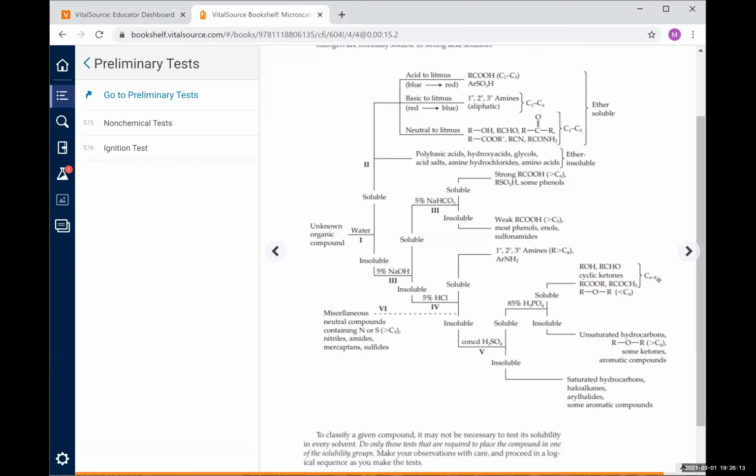And that's what that juncture is trying to convey. Does that answer your question? Though typically the moment you see water solubility, that's a signpost that you're likely dealing with an amide rather than an amine.